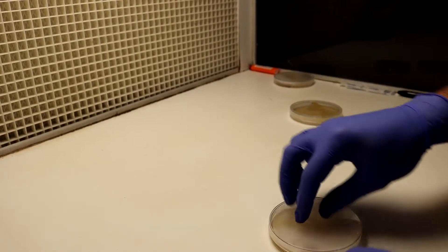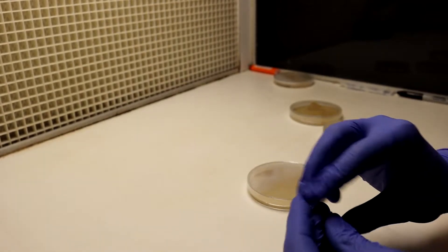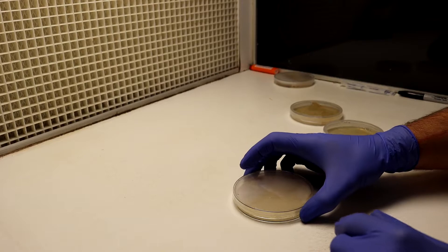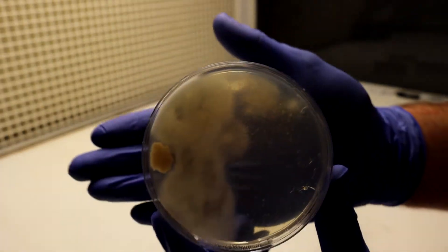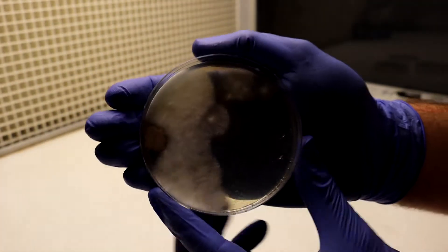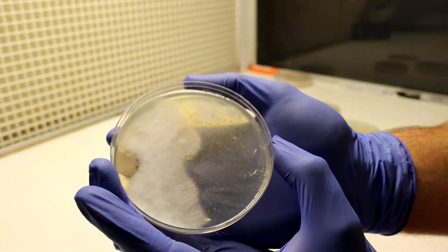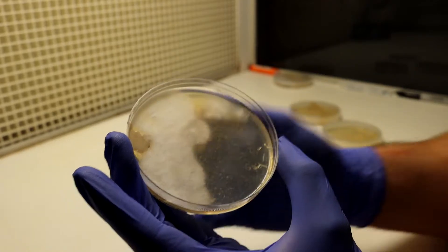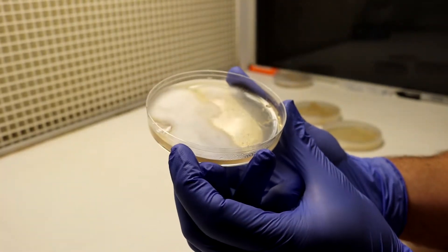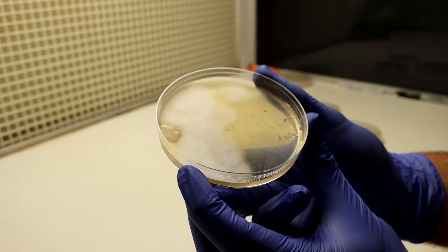Giant penicillium colonies — that's the stuff you find on oranges and it's antimicrobial. That's how we get penicillin. I'm uncapping and as you can see here there is a lot of growth. This seems to be maybe like a yeast, and I'm sure there's a ton of contamination in here from my mouth but it's not really showing up.